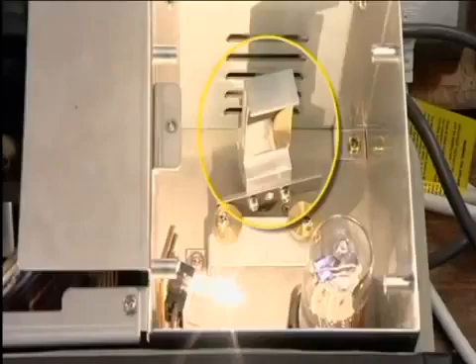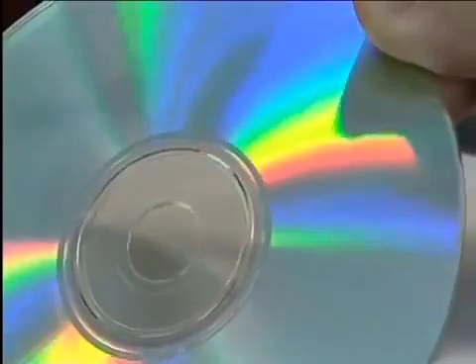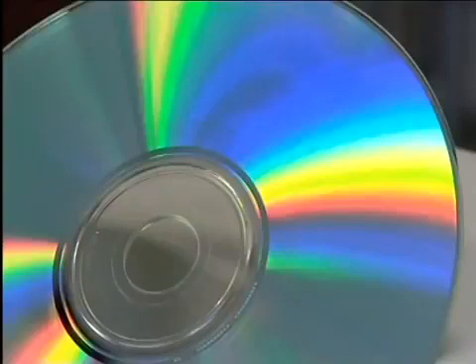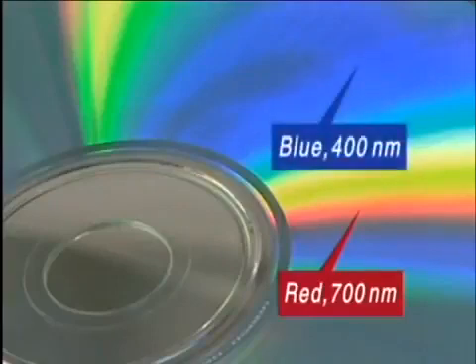This contains a diffraction grating that acts rather like the playing surface of a CD to split the light into its constituent wavelengths. Different wavelengths correspond to different colours. Red is about 700 nanometers and blue around 400 nanometers.